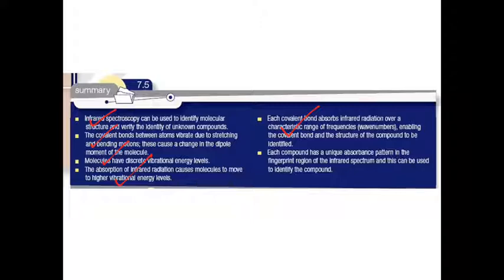Okay, now each compound has a unique absorbance pattern. Yes, we know that, in the fingerprint region of the infrared spectrum, and this can be used to identify the compound. Yes, we know that, but I've never seen an exam question using the fingerprint region. Now, only to do with functional groups.